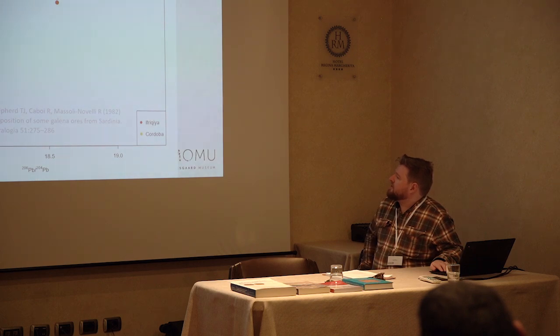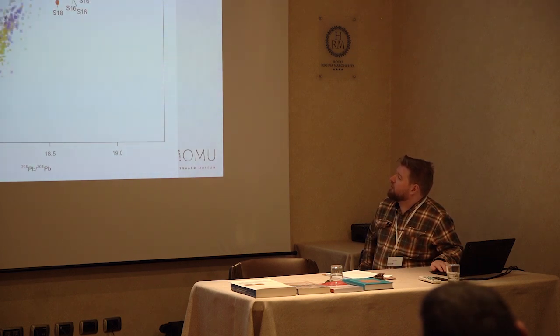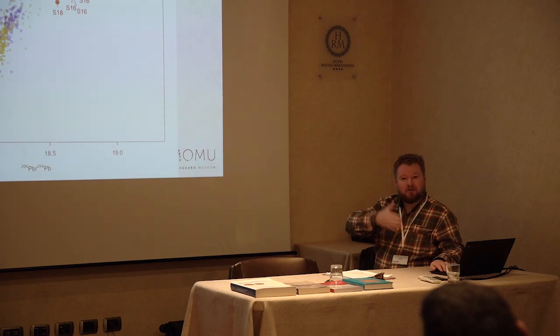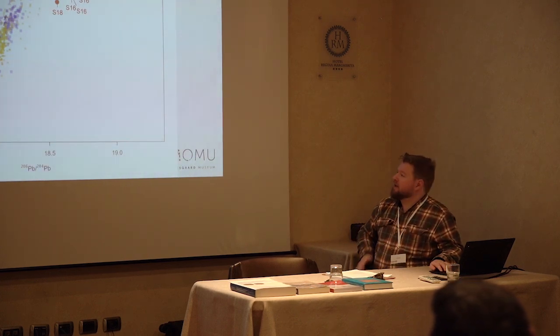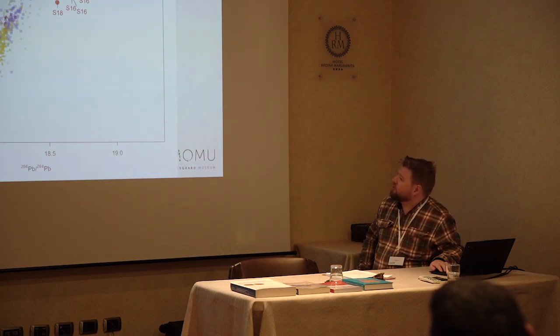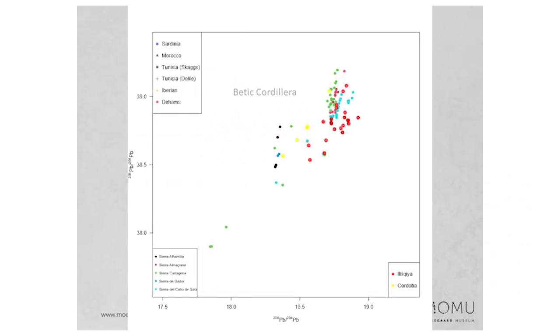So this now makes sense when you break it down, but you have to break it down. And so I wouldn't just shove this in a publication, but it's just to show. So that was our silver dirham results for the first 27 dirhams.